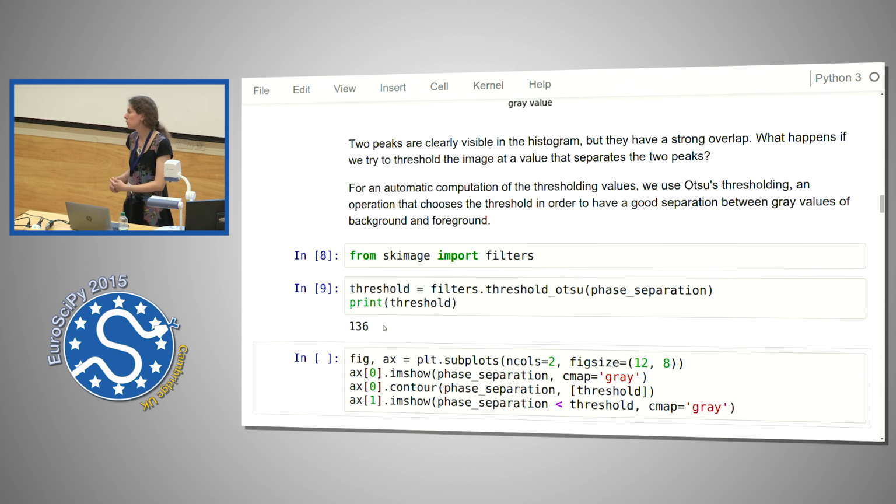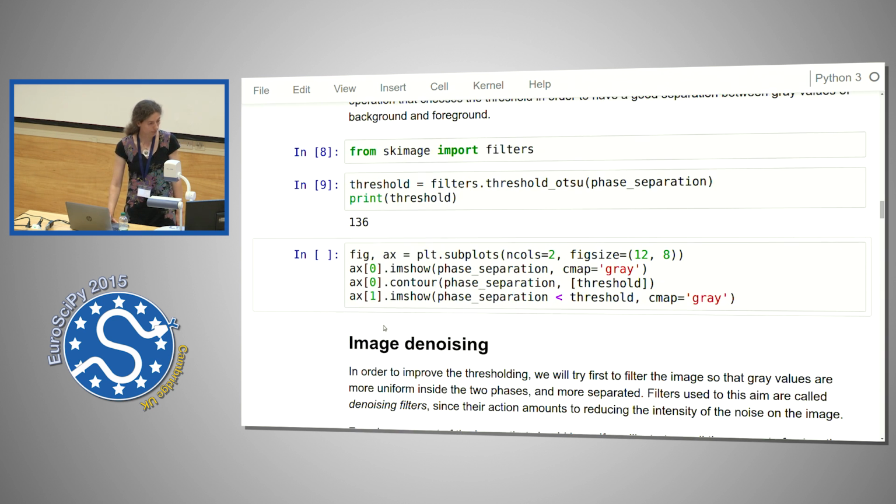I don't have to inspect my image manually to know this best thresholding value. And for example, I could use this in a for loop, looping over a batch of images, for example, when the exposure changes, when my image gets lighter or darker.